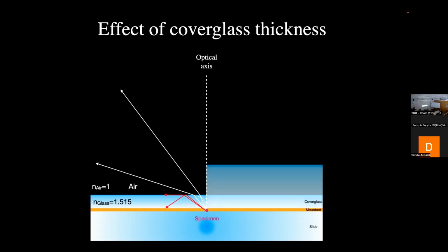And then if we have a much larger cover slip, this is very exaggerated, guys, but it's only to serve the purpose. But let's say any kind of different size of cover slip, light will still travel, as you learned, from glass to air with the same angles. But then if you look now, the apparent direction of propagation of these two rays of light that have the very same angles of these two, but they are much farther apart and in completely different positions. So creating a much larger defocusing of the structure that will appear enormously more elongated, all right?